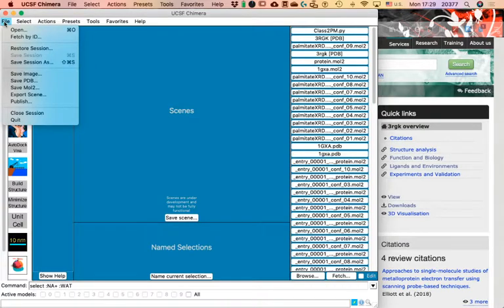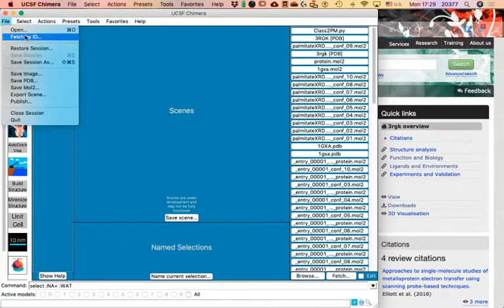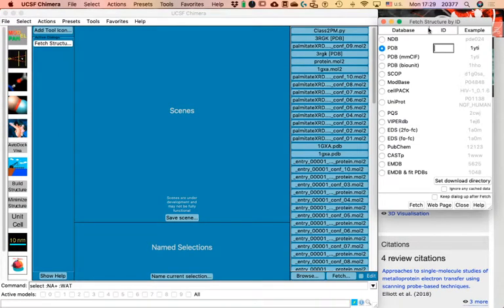As opposed to Microsoft Word-type applications, here each menu is devoted exactly to what it says. In the File menu, everything in there is for reading, writing, exporting, or saving files — that's it. The most common one for us is 'Fetch by ID' when we want to get a structure from the PDB. So click on 'Fetch by ID,' type 3RGK, and press 'Fetch' — you'll get the structure.